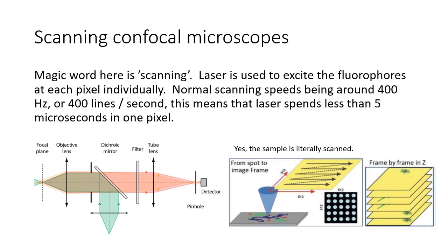Next, we are going to discuss confocal microscopes. Confocal microscopes are also known as scanning confocal microscopes, and the magic word here is scanning.